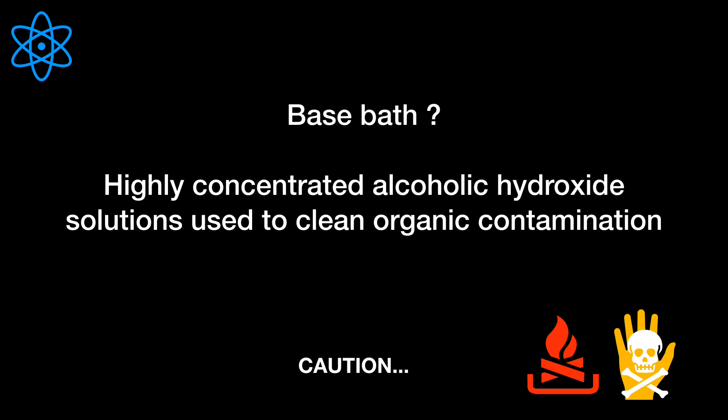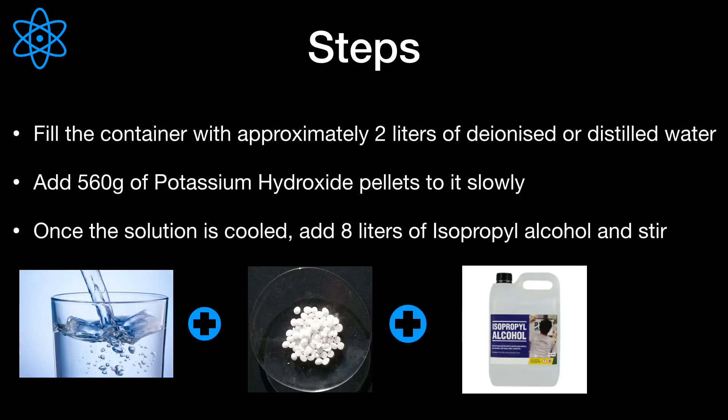The base that we use to make a base bath is potassium hydroxide, which is corrosive to skin, has acute oral toxicity, and can cause serious eye damage. On the other hand, the alcohol that we use is isopropanol, which is highly flammable, can cause serious eye irritation, and has specific target organ toxicity.